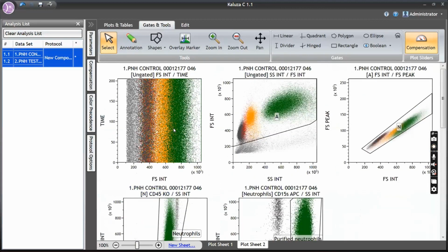So what is the final diagnosis? PNH clone. What should you give? Not detected. Not detected or PNH control? Yeah, so not detected. Okay. Now the next case you need to tell me.